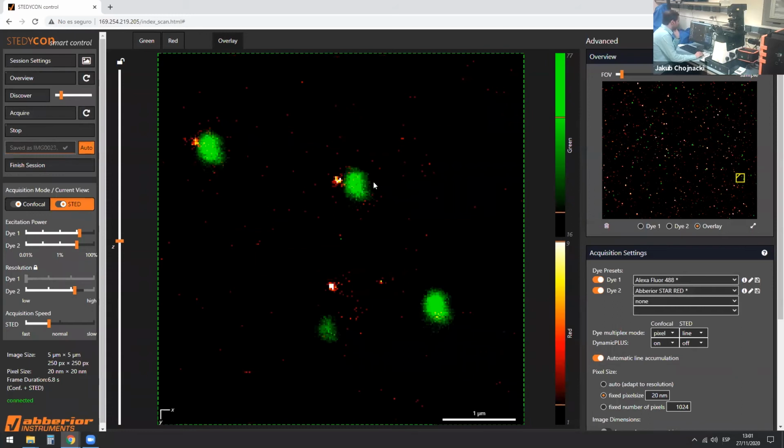Okay, so, as I was saying, unfortunately it looks like the virus particles have only very, very little spike protein on the surface. But this already actually tells me something interesting. We can see that there is a bit of a separation between the green signal, which is roughly the center of the virus, and the orange signal. That indicates to me that this spike protein, and whatever is labeled, is actually very, very large. And if you remember, when we looked at the HIV, those orange signals were very, very close to the green signal. So we already have some interesting results here, I think.